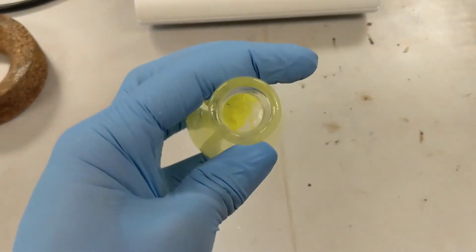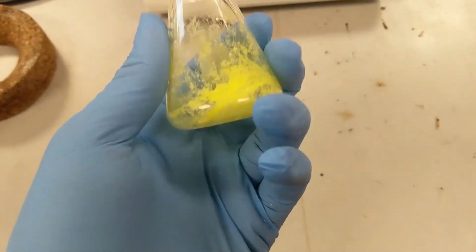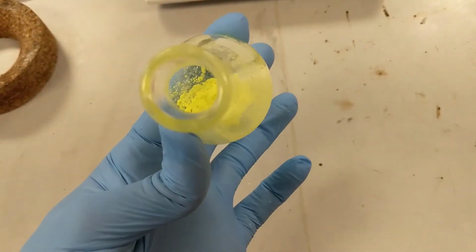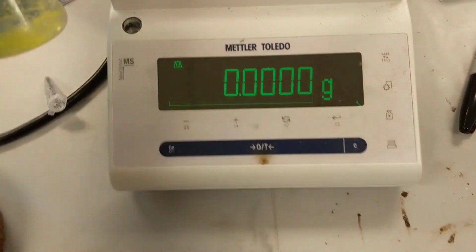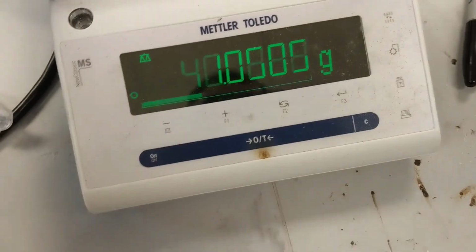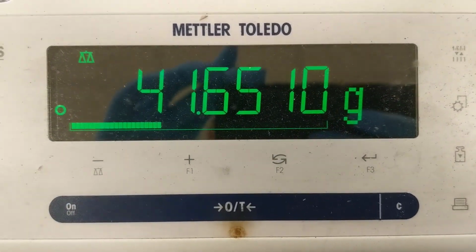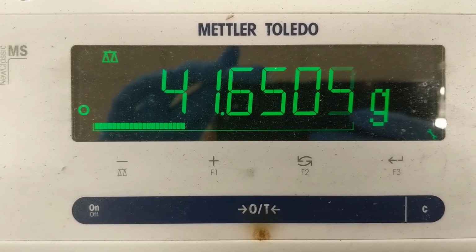Alright guys, I have it all evaporated off and you can see this is pure unknown A sitting in there nice and dry. Now we're just going to weigh it. I'm going to tare my scale, add it on there, close the door. There we go. And I'll get you your data in the next clip.